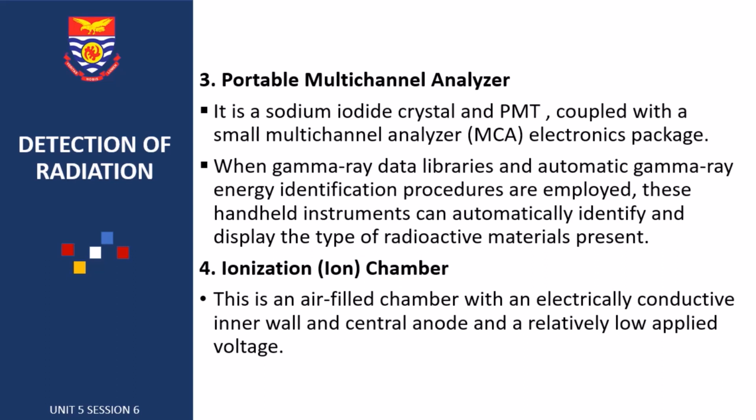The portable multi-channel analyzer employs gamma ray data libraries and automatic gamma ray energy identification procedures to automatically identify and display the type of radioactive materials present in a sample.